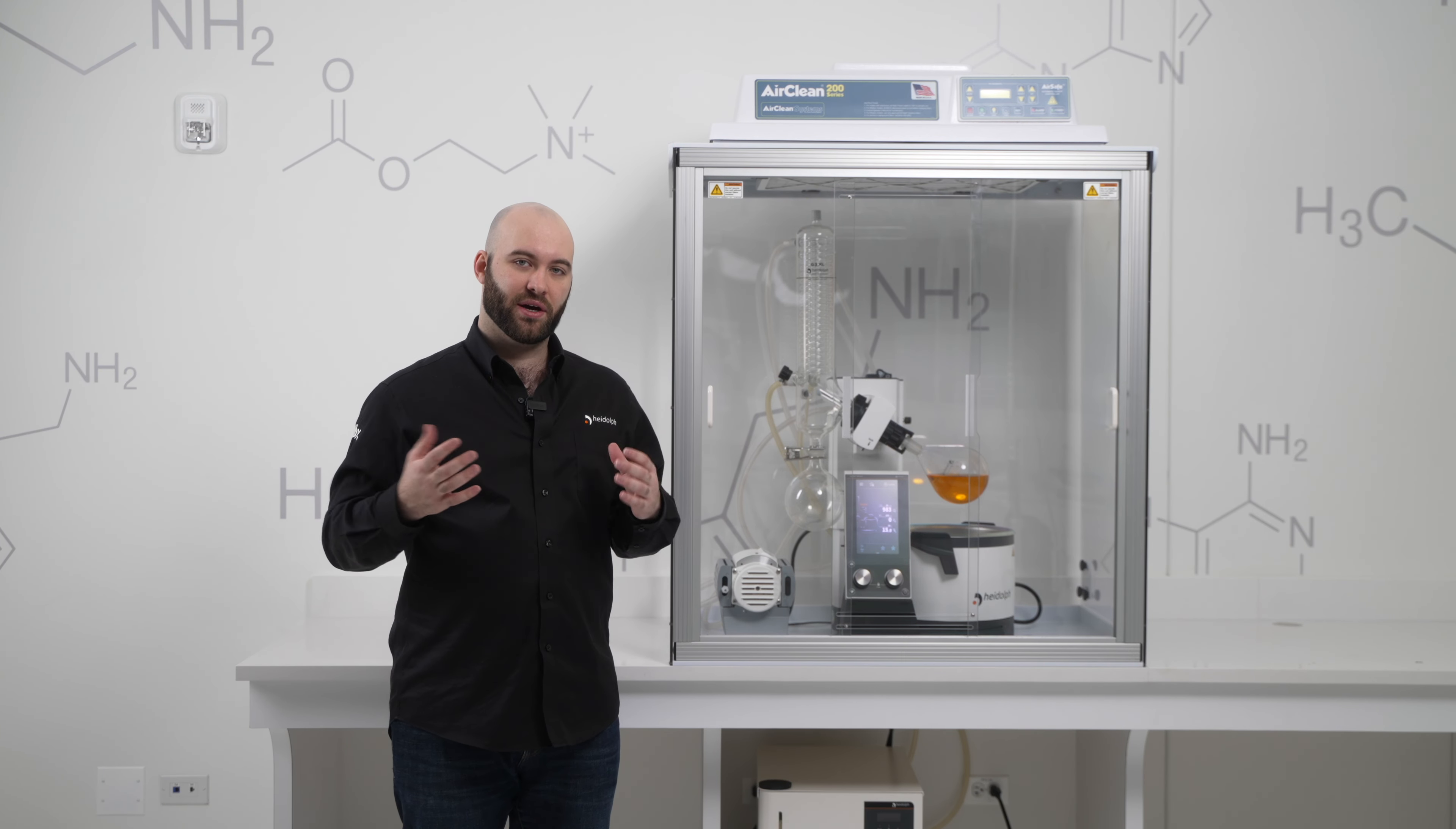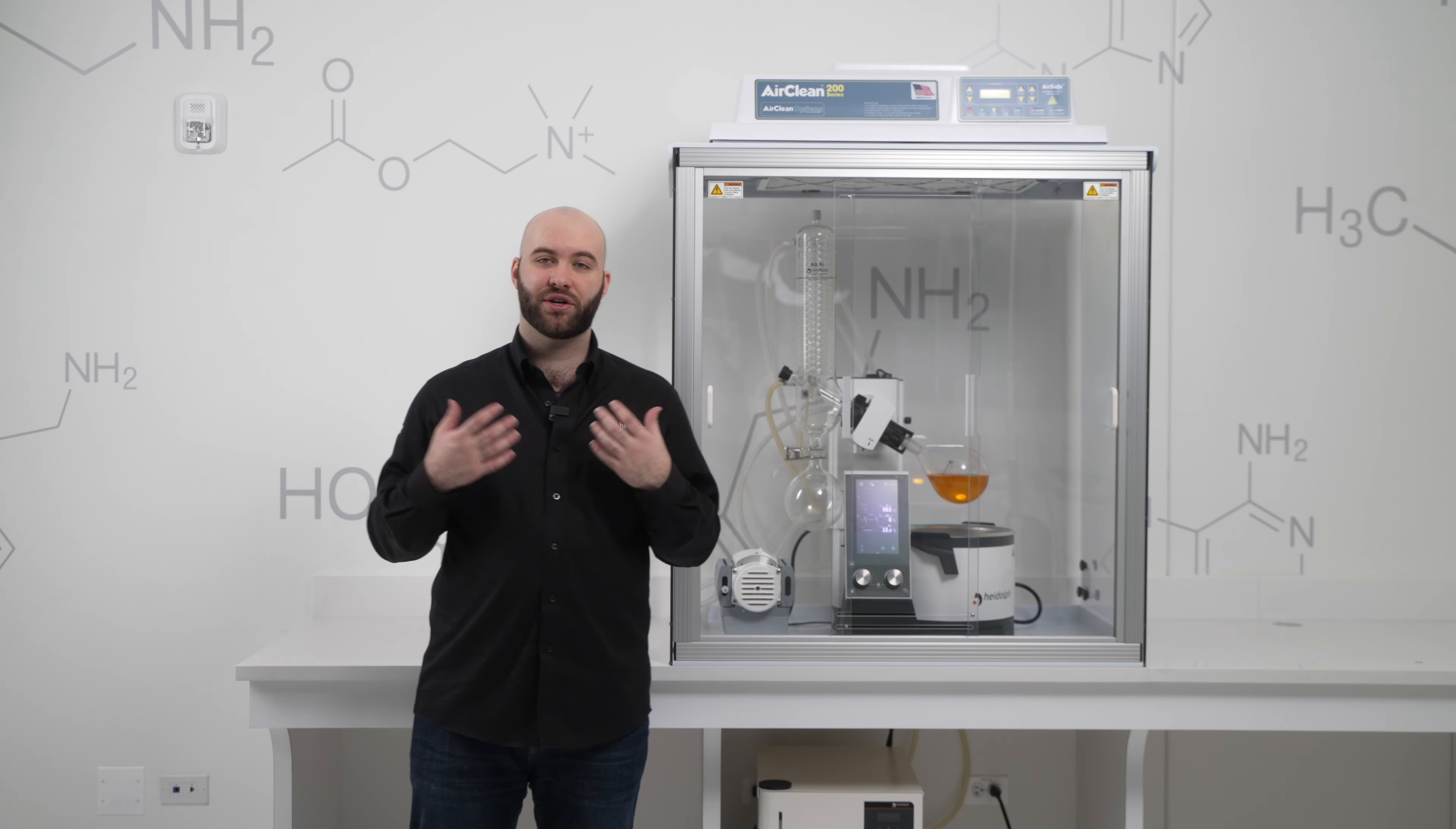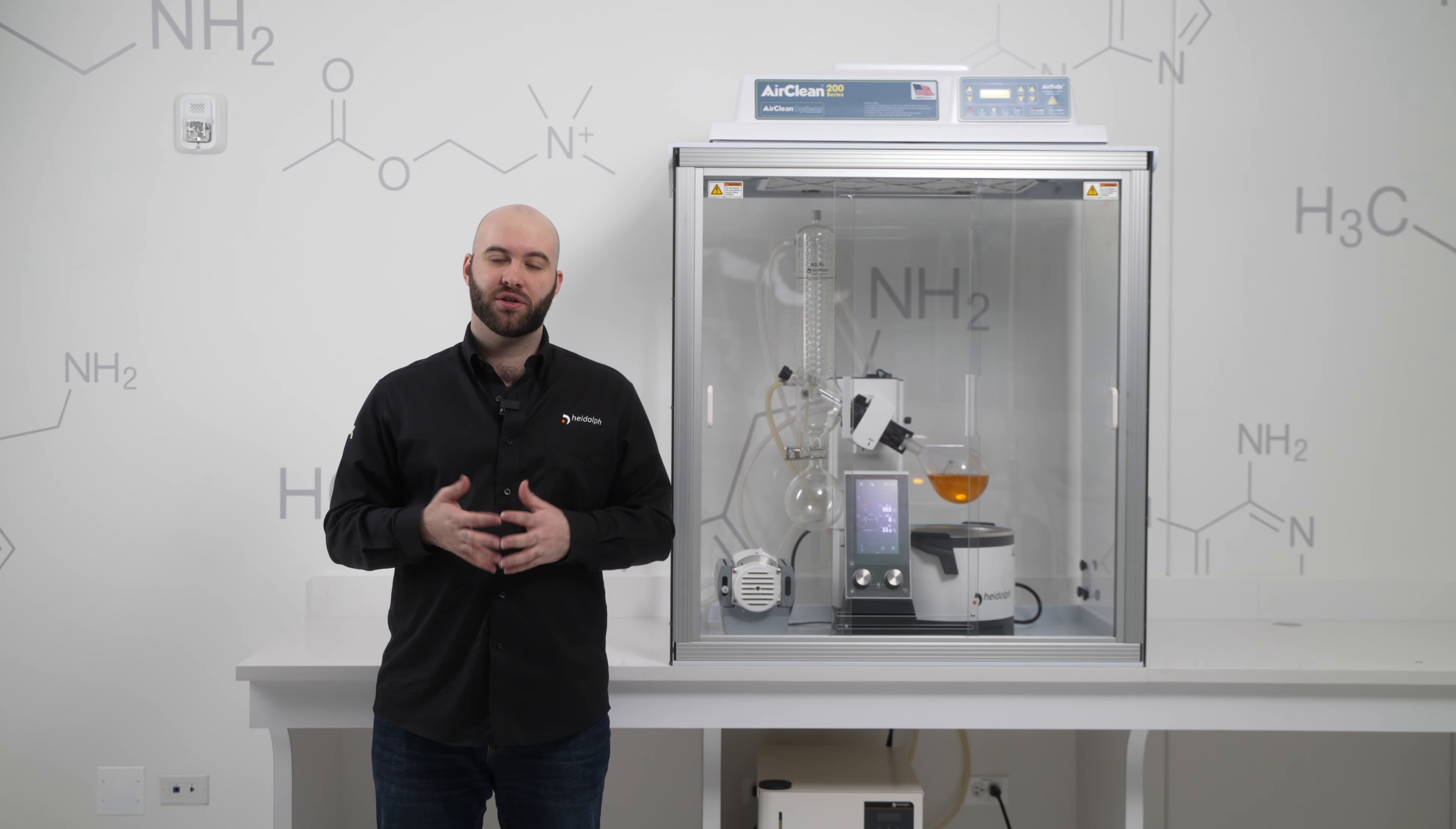Despite the small footprint of the fume hood, it feels like there's a lot of area to move around in there, so operation doesn't get hindered. You don't feel like you're working in an enclosed space, and the filters inside provide a higher degree of safety than your typical lab bench evaporation.